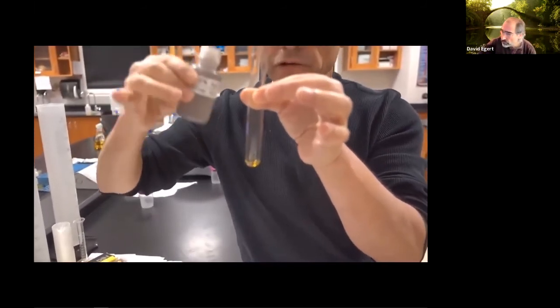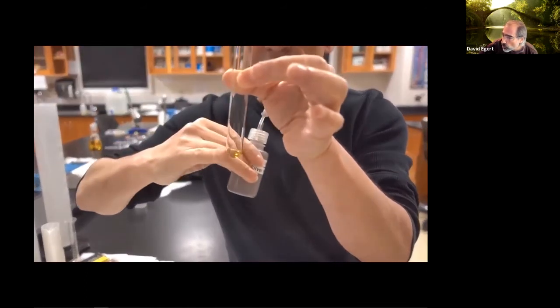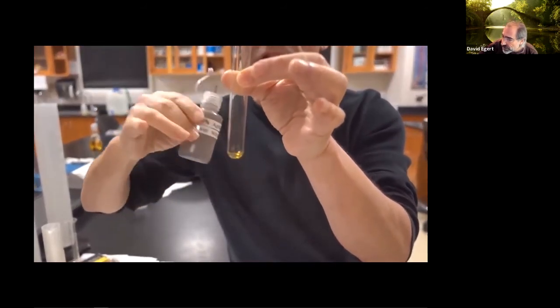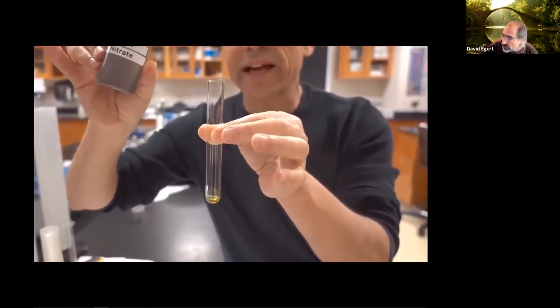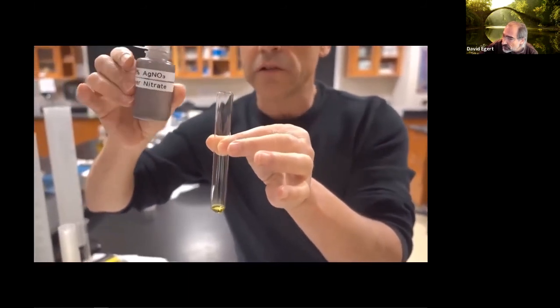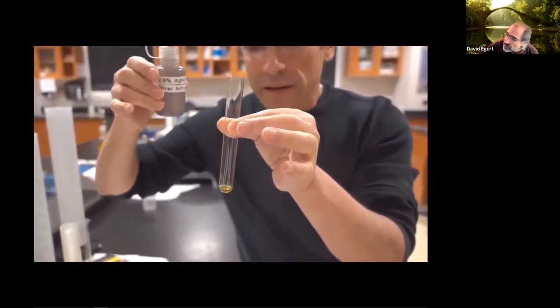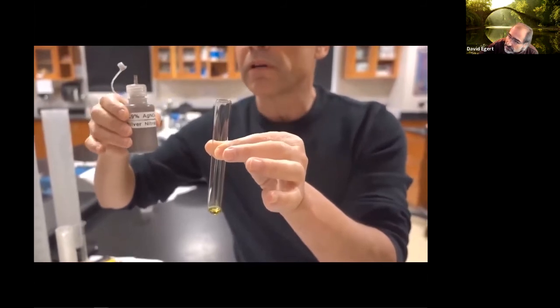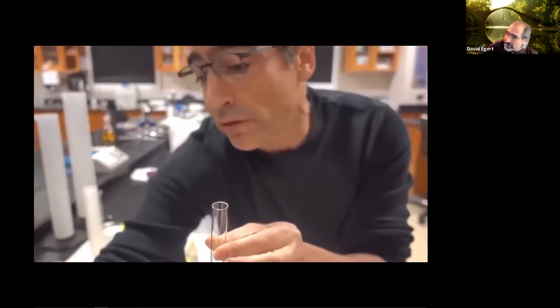And I'll keep adding drops of silver nitrate until this solution here stays brown. And the total number of drops that I add here is going to be the value of the milligrams per milliliter of sodium chloride that I have in there.